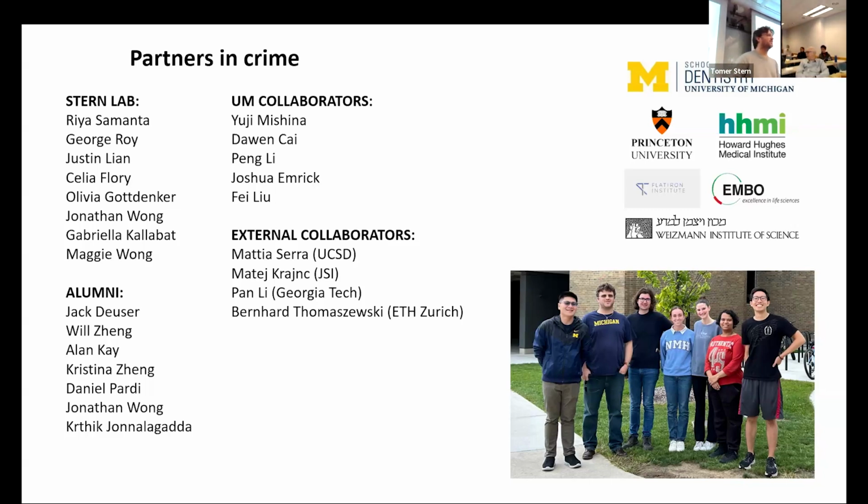If I understand correctly, you just said the other segmentation methods like Cellpose are not doing very well on segmenting the embryos. No, it's doing phenomenal work. I think that Cellpose is hands down probably one of the top three algorithms, but it still accumulates error very fast. You have 5,000-6,000 cells every time point, and it's increasing all the time. And when the cells go in, the fluorophore level is going down. So it's a bit much to expect a pure segmentation algorithm to manage all of this. Cellpose is doing phenomenal work. It's still far from what we need.